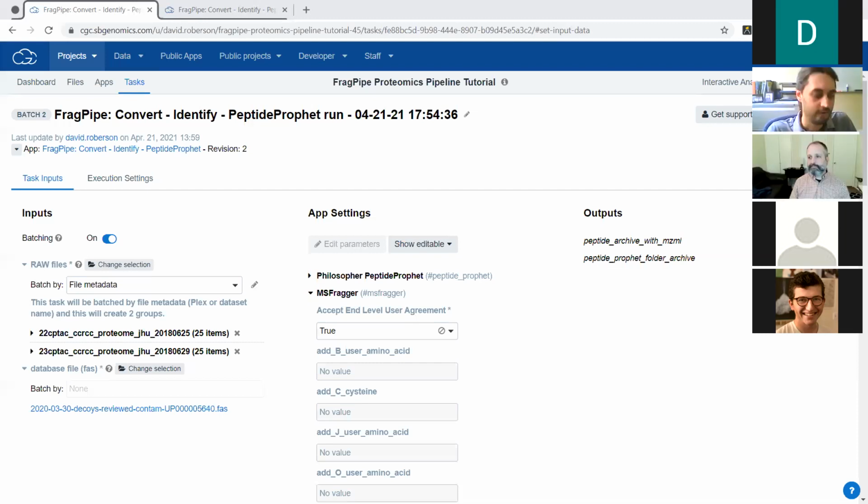That's actually the standard workflow, or standard way of processing DDA proteomics, the common shotgun data analysis. We need to filter the data first because we have to apply the false discovery rate. Otherwise, you're going to quantify peptides that might not be true positives. That's how pretty much every pipeline operates.